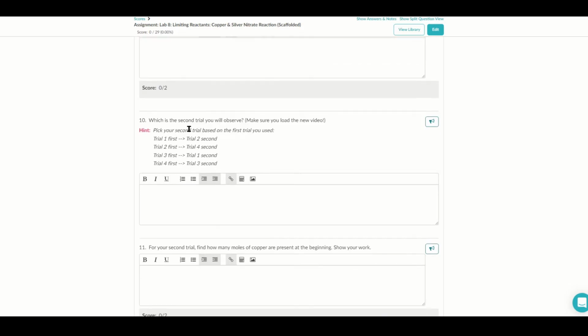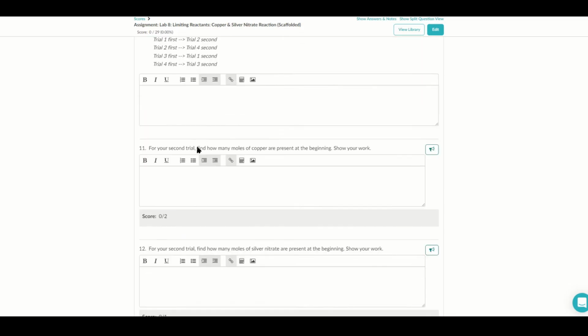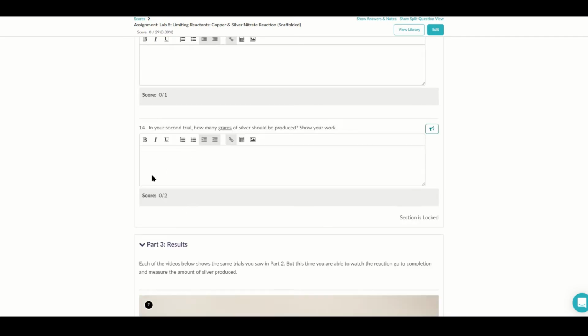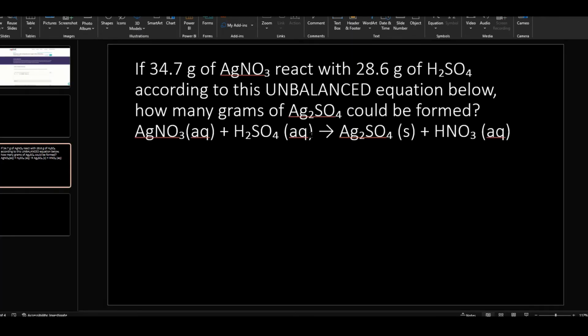You're going to do this 2 times. So you're going to complete that all over again, but for a different trial. Okay, so it's just the same thing twice in part 2. So let me show you how you would go about that.